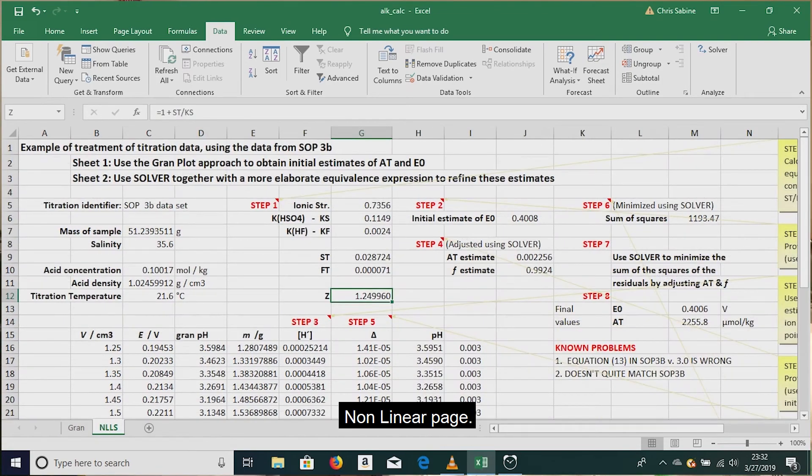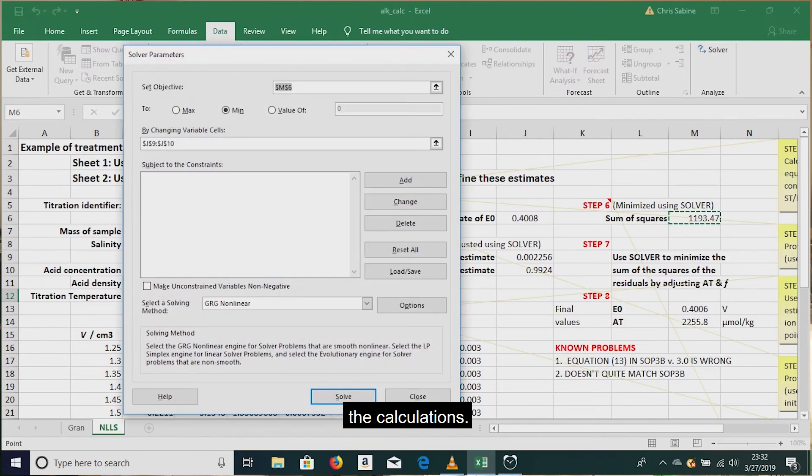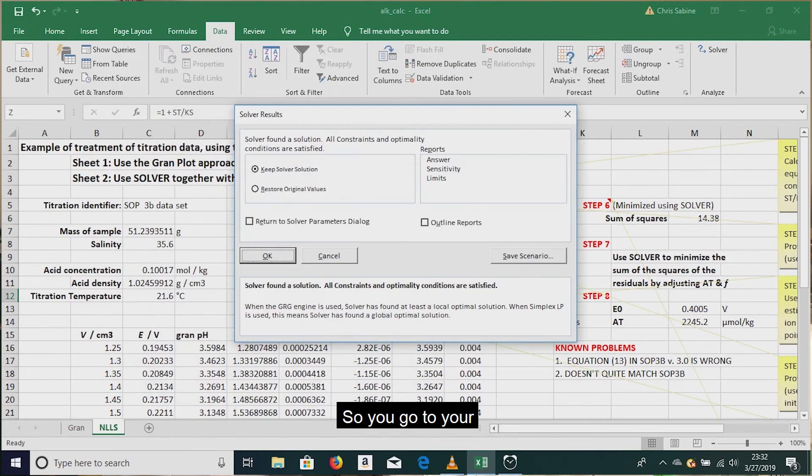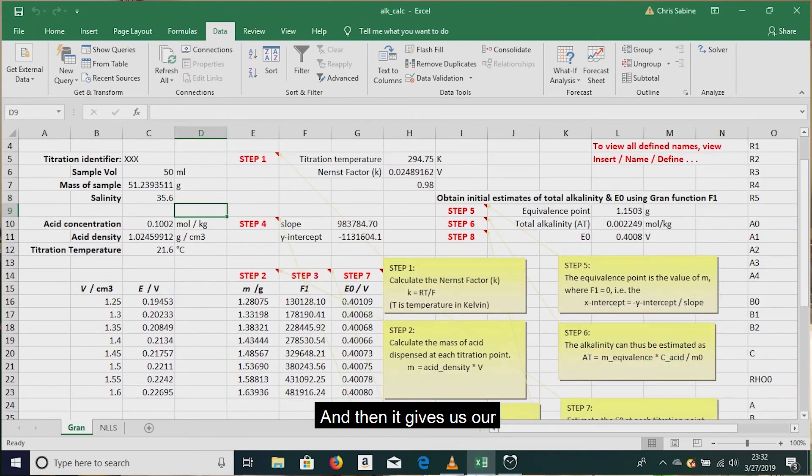Then we go over to the nonlinear page. All the information from the previous page is copied over, but we want to do the calculation. So you go to your Excel function called Solver, and you click on that, tell it to Solve, OK. And then it gives us our alkalinity value of 2347.6.